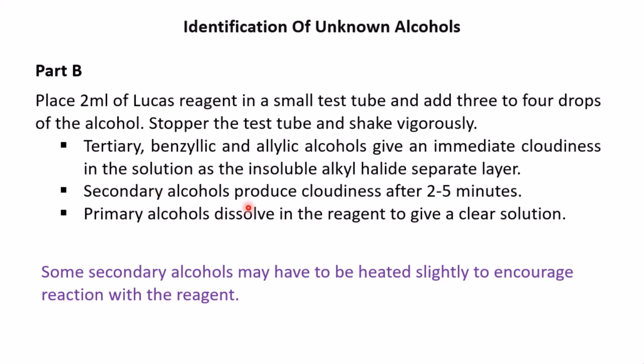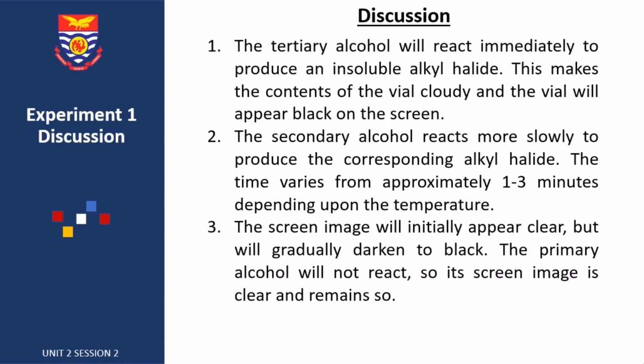However, for secondary alcohols, the cloudiness takes between 2 to 5 minutes, or 3 to 5 minutes. The primary alcohols may not react at all, giving you a colorless or clear solution. This is basically a summary of everything on the Lucas test.